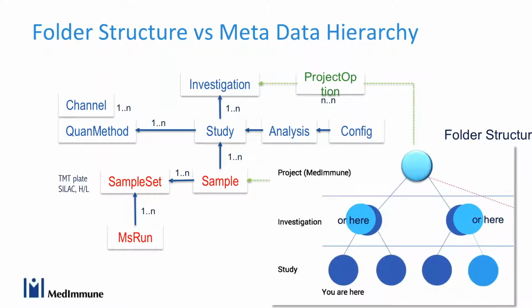One of the things that we had to learn our way around is, in LabKey, I'm sure you're aware of that, everything is organized by folder, right? You set up your folder, that's the scope for the access control, and you put your files there and decide to do something about it. In this case, that's how we organize the data as well: we have top-level LabKey projects, but we also define the folders that can be investigation, study, samples or analysis, sitting in either single folders or multi-level folders.